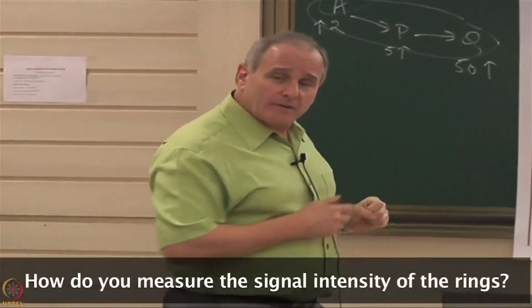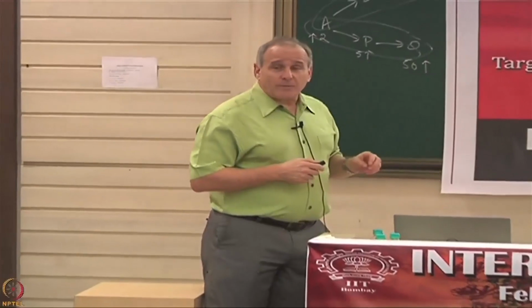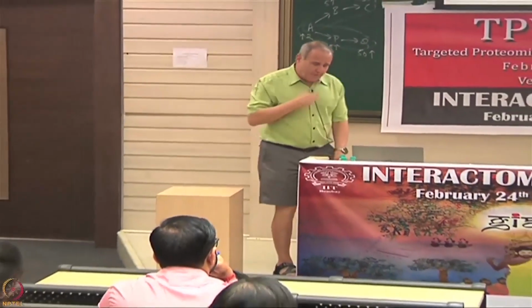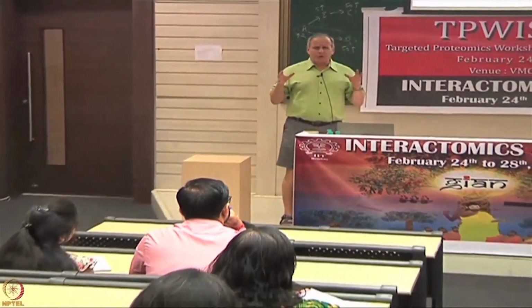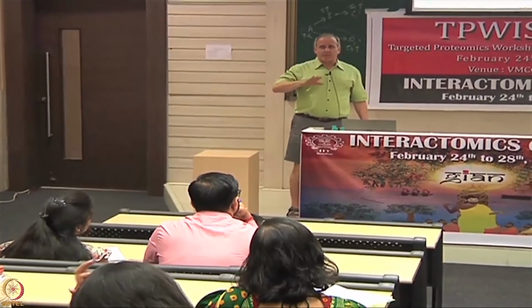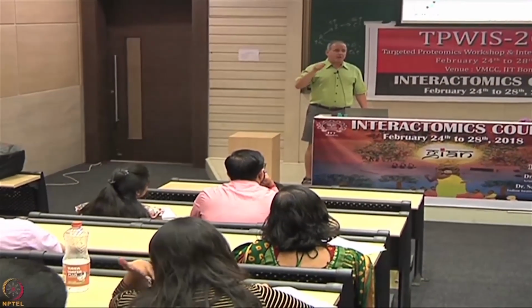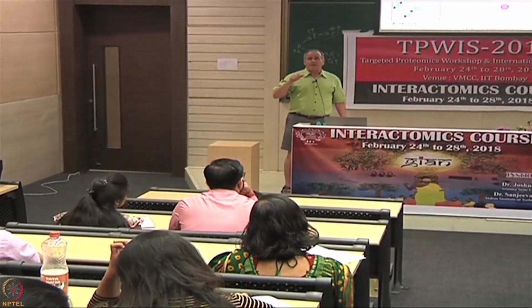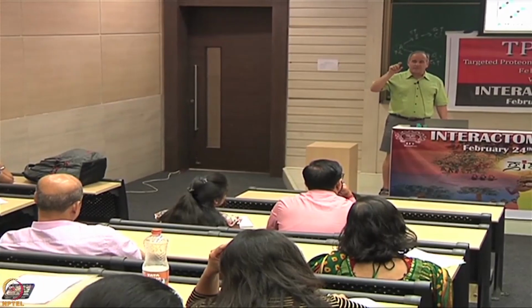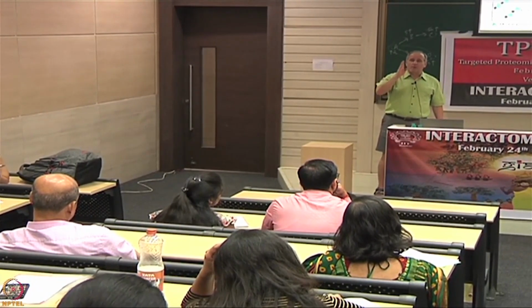And yes? What does the ring basically mean here? The ring? Yes. Oh, how do we get the value for that? Yeah, that's a little complicated. What we do currently is that we have a software application that pulls up the images, and the investigator doesn't know what the spots are, but we have a 5-star scale for scoring a spot from 1 to 5.